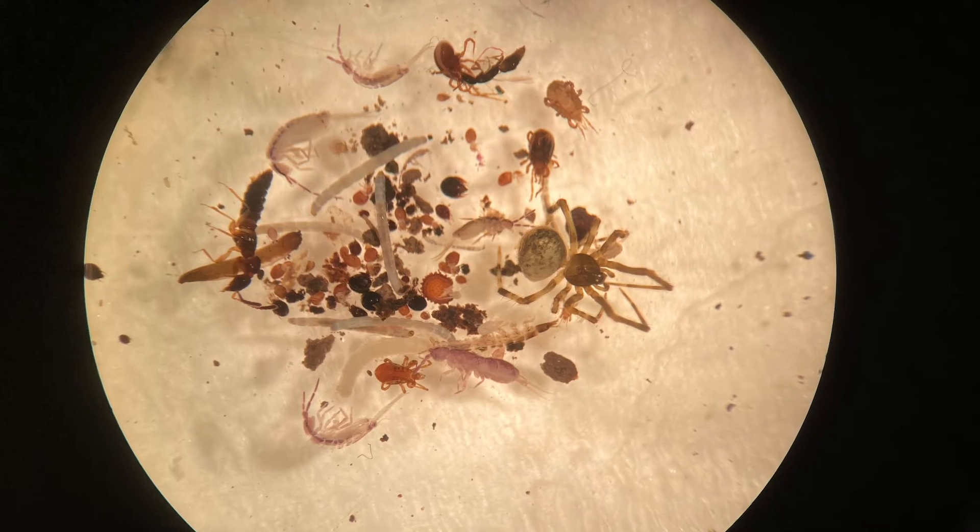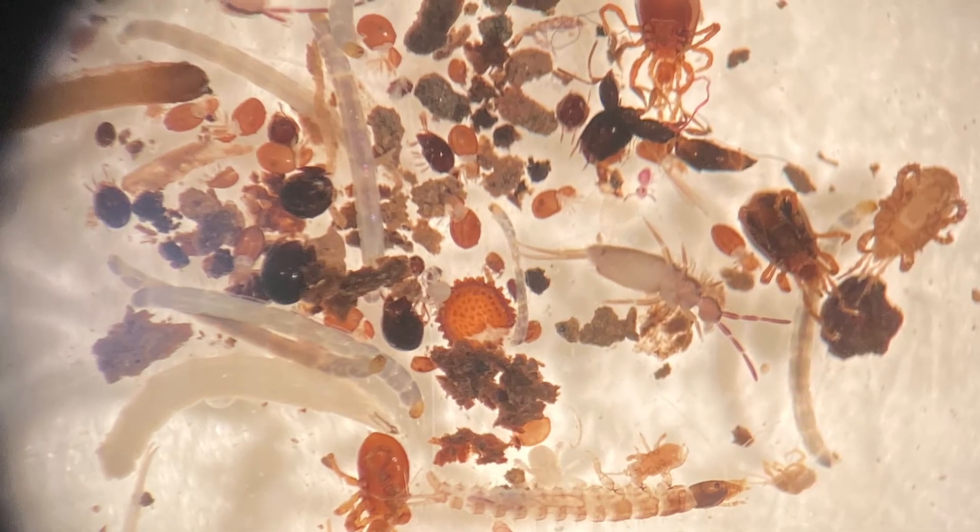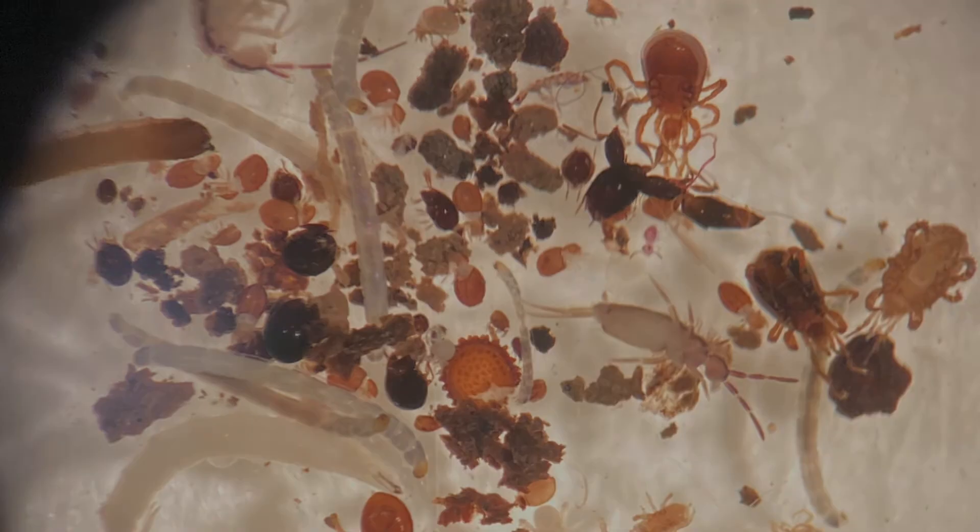This is an example of what you can find with a successful Berlese funnel sample. Look at the amazing diversity from a single soil sample.